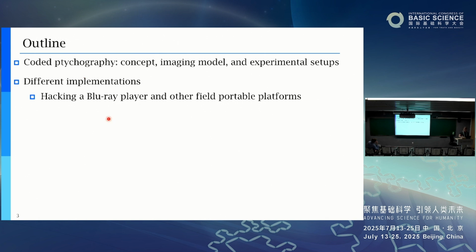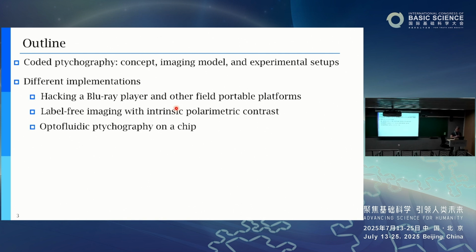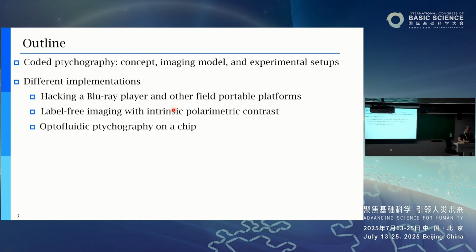You can buy a low-cost Blu-ray drive and repurpose it to perform this ptychographic imaging in your home. We also want to talk about label-free imaging. Without using any stain or labels, we try to get a good contrast of the sample. We try to combine this with flow cytometry, so we want to talk about this optofluidic ptychography on a chip.